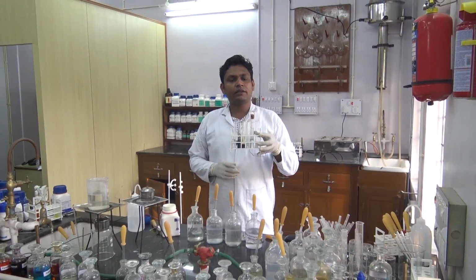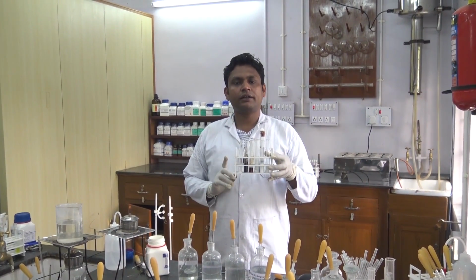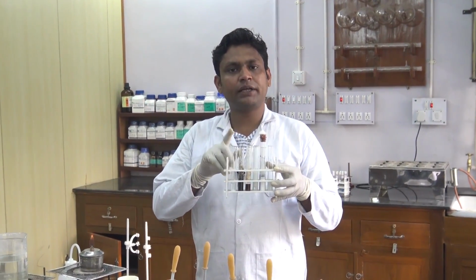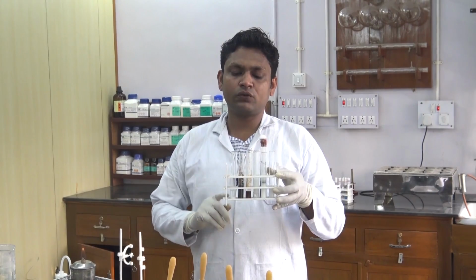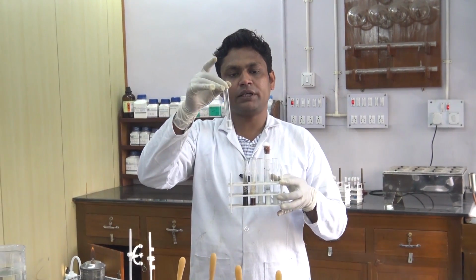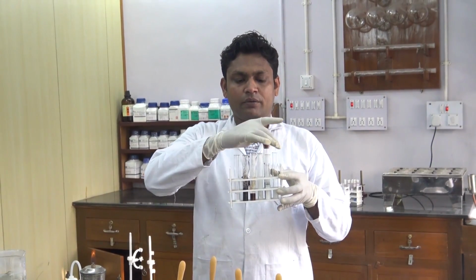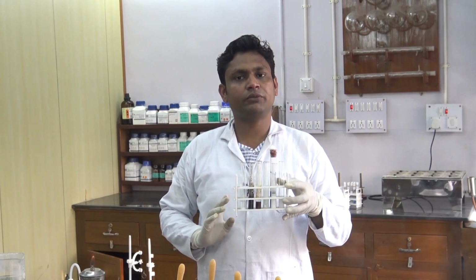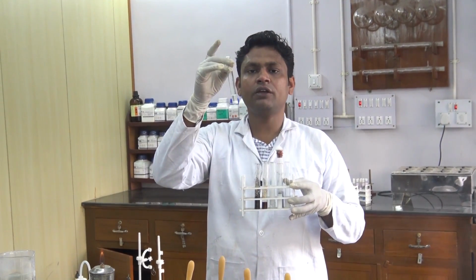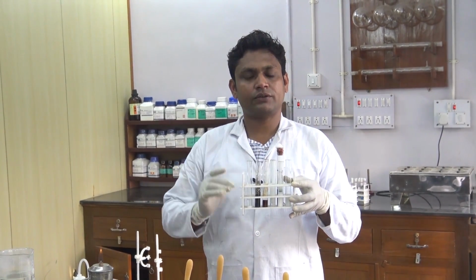After performing the 5 group reagents, we will test for the cations for which the group precipitate has been formed. Hence, since we have group 1 precipitate present in our sample, and the other 5 precipitates remain absent, then we have to test for only the group 1 cations, not for all basic cations.